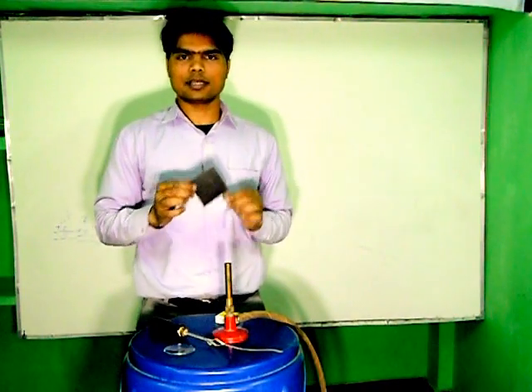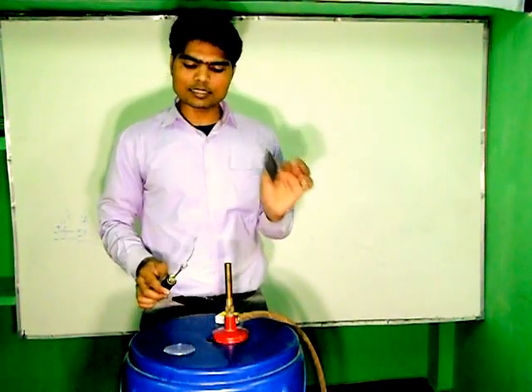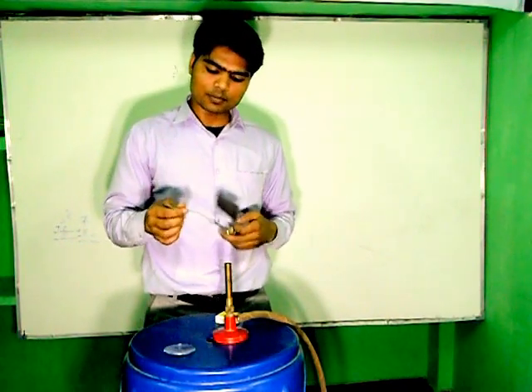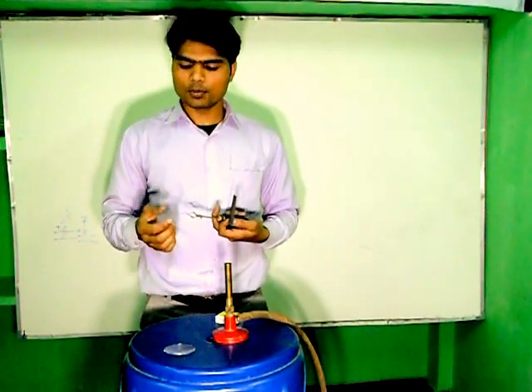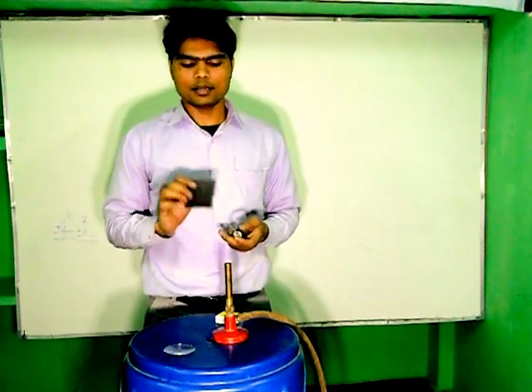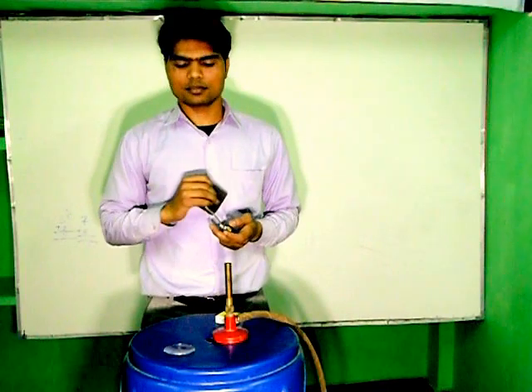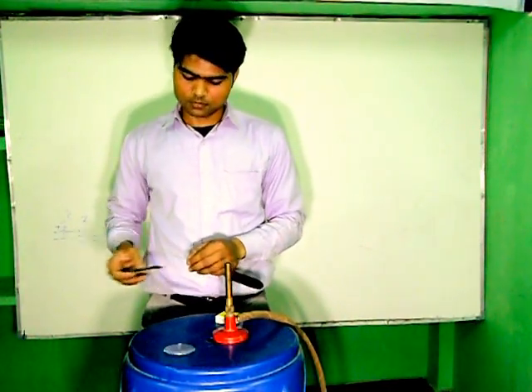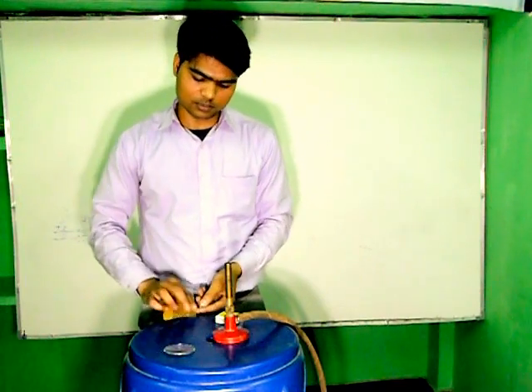Now we have Sandpaper. We use this Sandpaper to rub the Magnesium Riven so that the Oxides of the Magnesium Riven remove. Because whenever the Magnesium Riven burns without rubbing, it will not burn properly. So first of all, there is need to remove the Oxides of the Magnesium Riven.